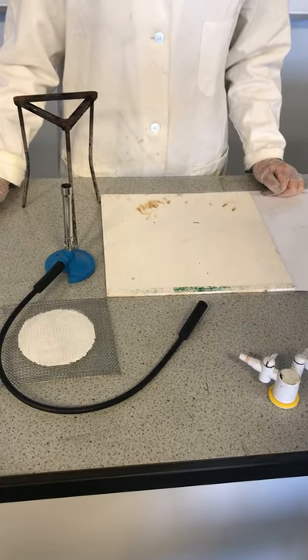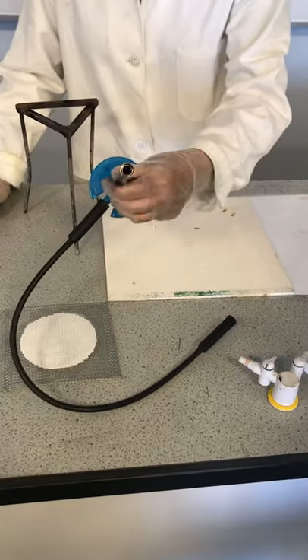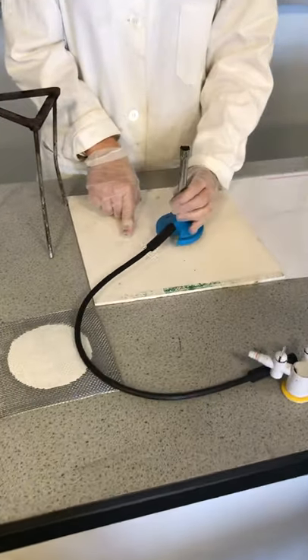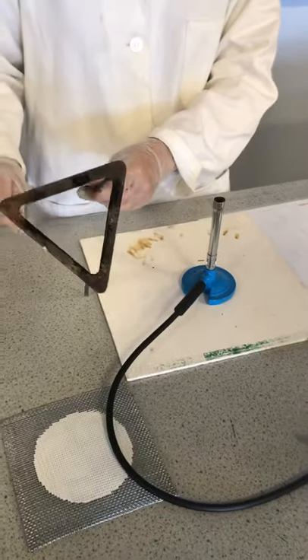We will now do a setup of these heating equipments by placing the Bunsen burner on top of the heatproof mat, and then place the tripod over the Bunsen burner.